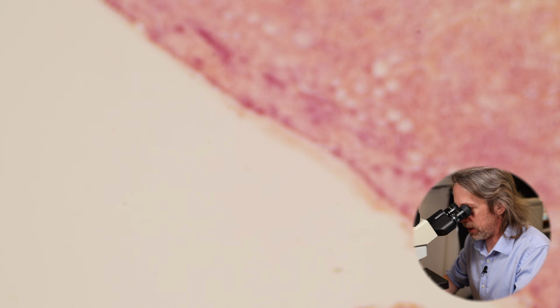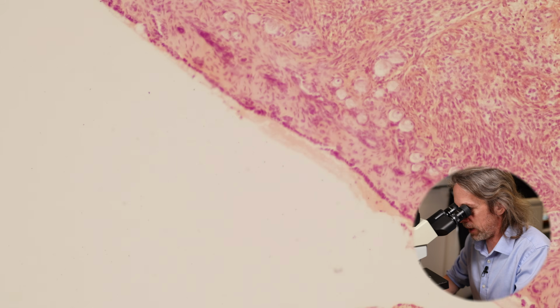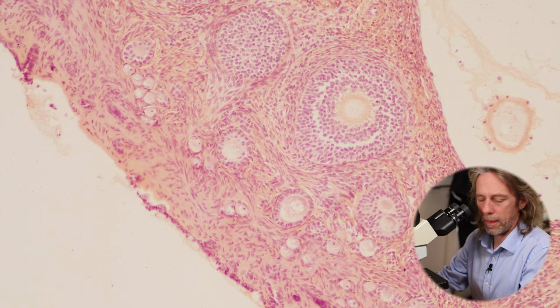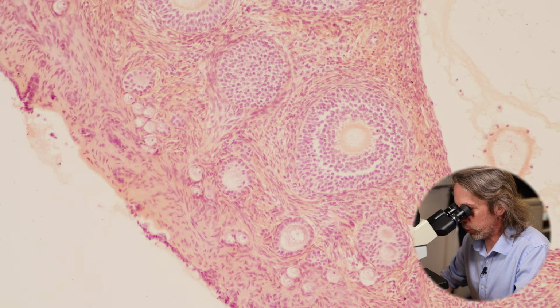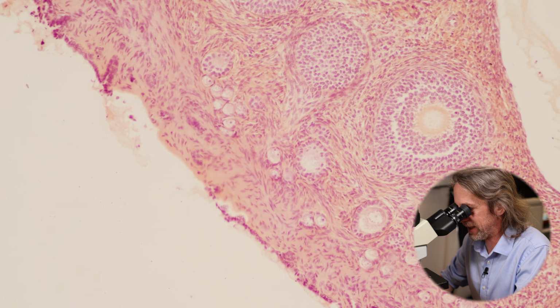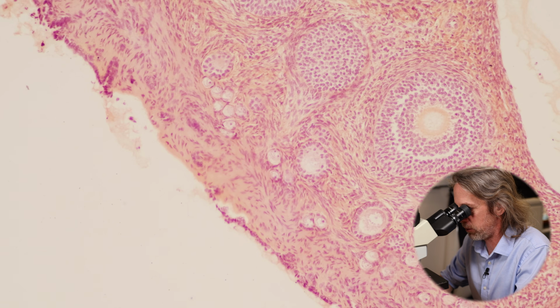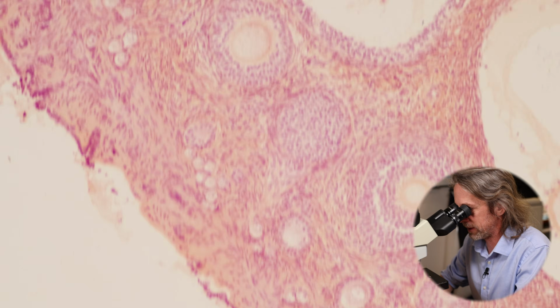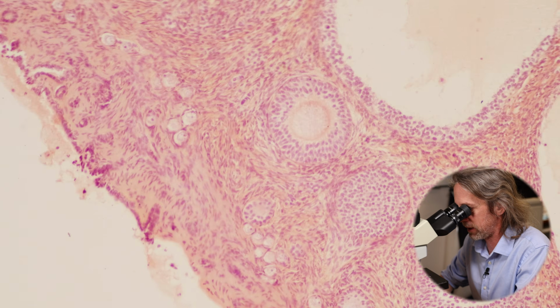Alright, so let's zoom in, and what we should see, if we get out to that tunica albuginea level, well, look at that, we can see lots of circles, and I don't know if you can imagine this, but we can see circles in slightly different stages of development. This is perfect. We've got some little circles and some slightly bigger circles and then some slightly more complicated circles and then some even bigger circles again.